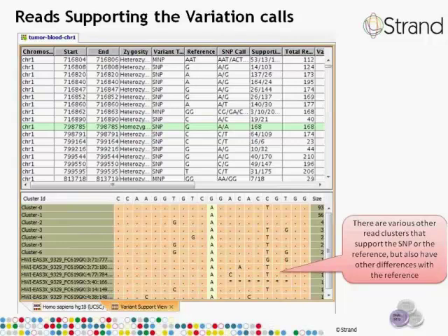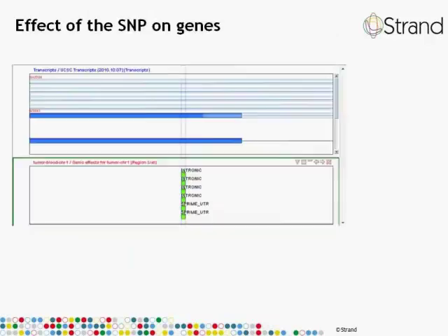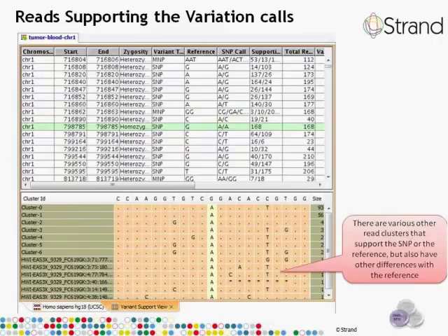This first line is indicated as cluster 0. We have effectively clustered 93 reads into one read and represented them as a single line, because all the reads in that cluster are identical. The second line indicates that there are 56 reads, which are all identical except for one position.